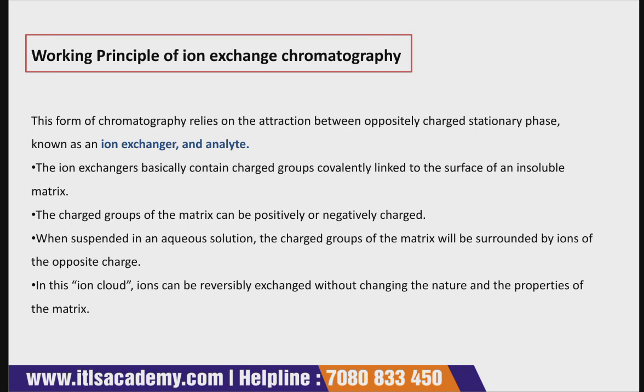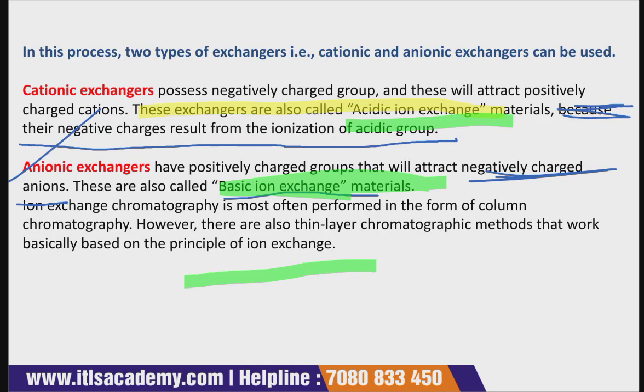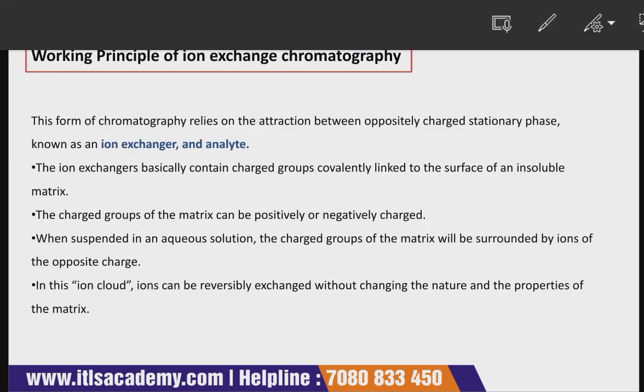Now let's understand the working principle of ion exchange chromatography. This form of chromatography relies on the attraction between oppositely charged stationary phase, known as the ion exchanger, and the analyte. So this form of chromatography relies on the attraction between positive and negative charges.